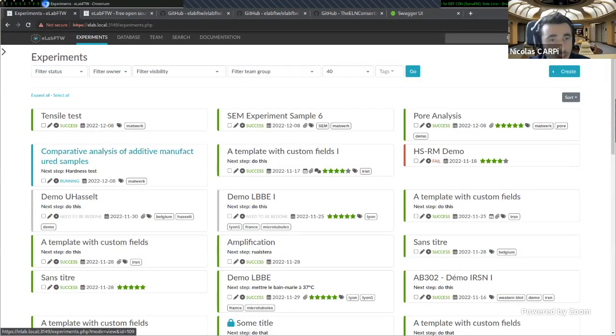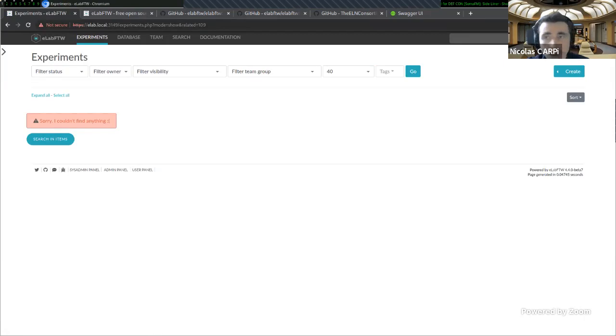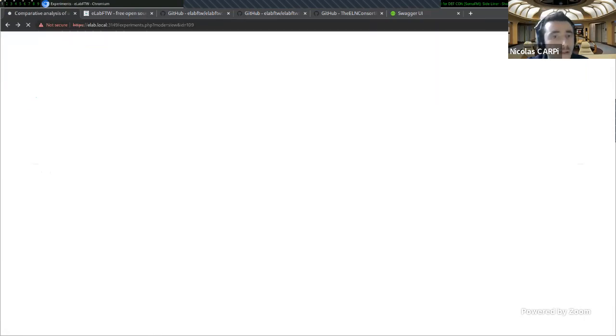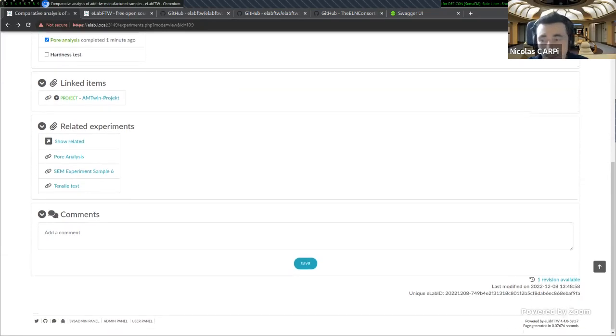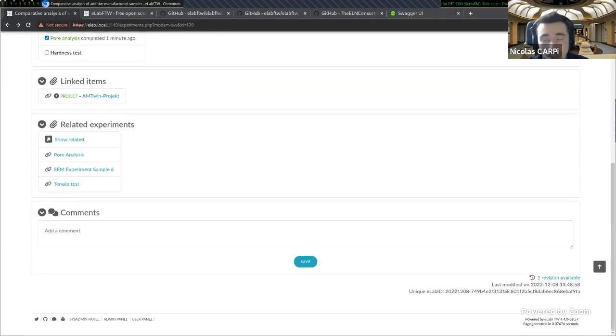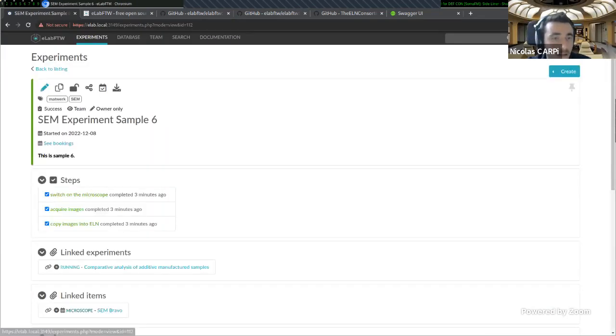Another interesting aspect that you can have, for instance, is that now I will click here on show related. Sorry, it doesn't work like this. So sorry for this little bug. I need to fix it. I'm showing you the beta version, so that's why. So let's go again for the same experiment.